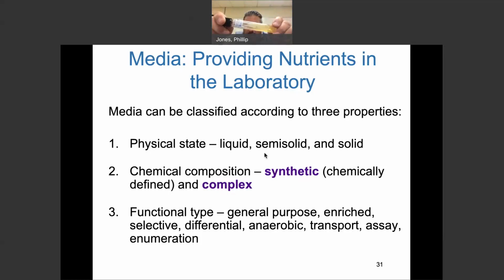I know there's condensation in there, right? But you'll see the white, that's E. coli growing in there. Now the advantage to this over a flat plate is condensation. If it drops on here, it will disperse the culture and destroy it. With this, the condensation is on the glass. It doesn't really hit the organism, but maybe at the bottom. But I can visually see this. All right, so there are some advantages to that.